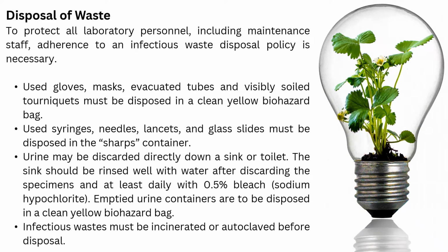In the disposal of waste, we must protect at all times not just the laboratory personnel, but that also includes the maintenance staff. That is why we have to adhere to the infectious waste disposal policy. The used gloves, masks, evacuated tubes, and visibly soiled tourniquets must be disposed in a clean yellow biohazard bag. Remember, that's a clean yellow biohazard bag.